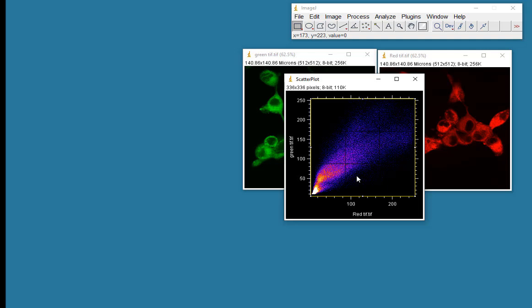So that was a fairly quick run-through of a few different ways of looking at co-localization. There are lots of co-localization plugins available for ImageJ. Have a try at them and see how you get on. Thank you.